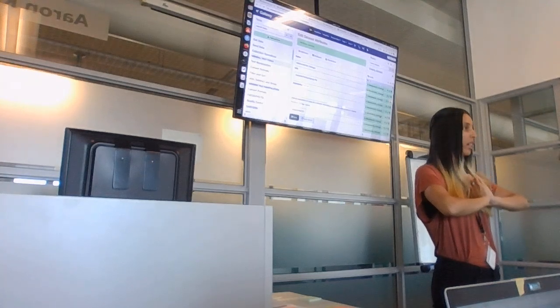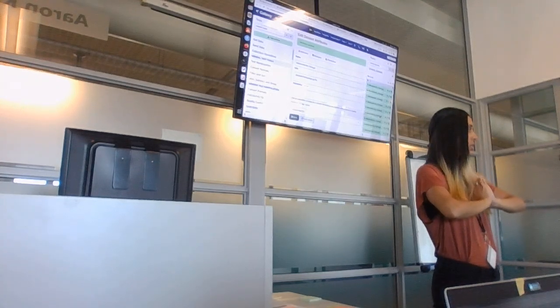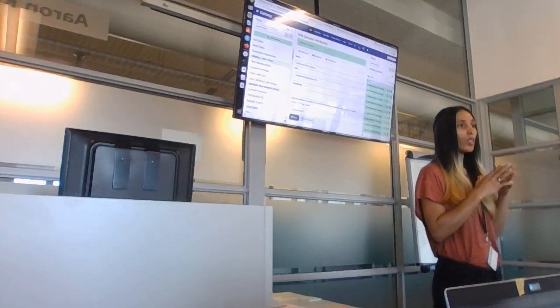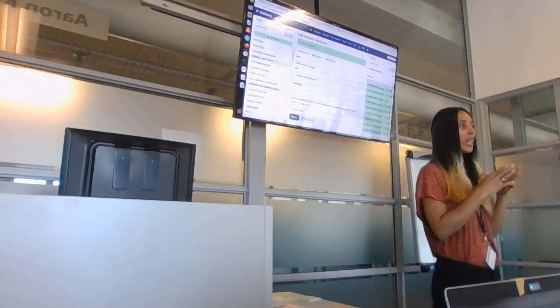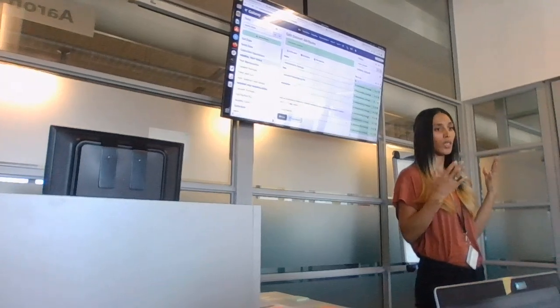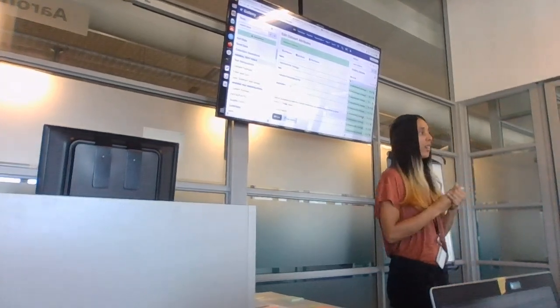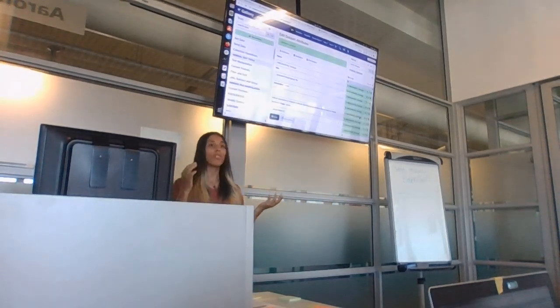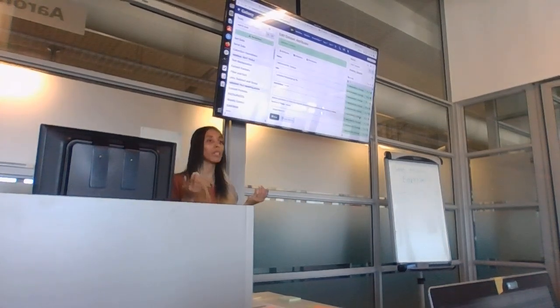So one of the first things you're going to check if there are Illumina files is: do I have two files with the same name? Do I have pairs of files? Is there something in common? Can I identify which one is the forward read and which one is the reverse read? What pattern is in there for me to check? What do you often see? Who works with Illumina?